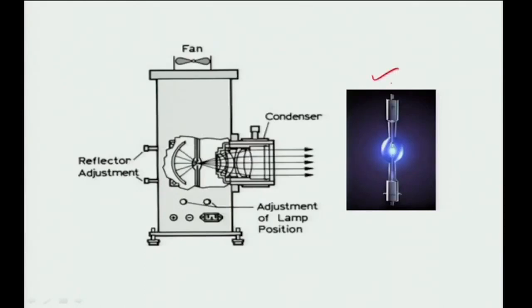Okay. Now, this is a personal request from my side. Do not take the cover off and look at a xenon lamp, because that might be the last time that you look at anything, right? The reason is, depending upon the power, depending on the wattage, these are very high luminosity, very high intensities. Even before you realize, it will damage your eyes. Okay, you would never want to do that, right?